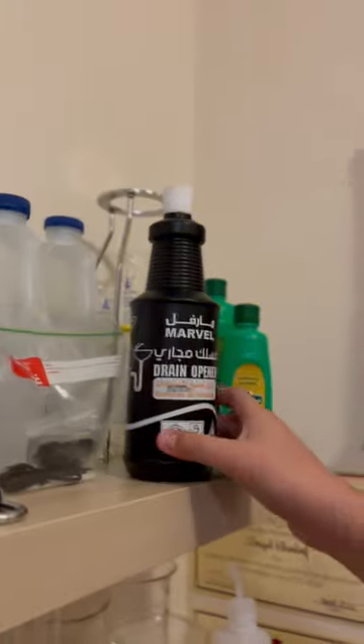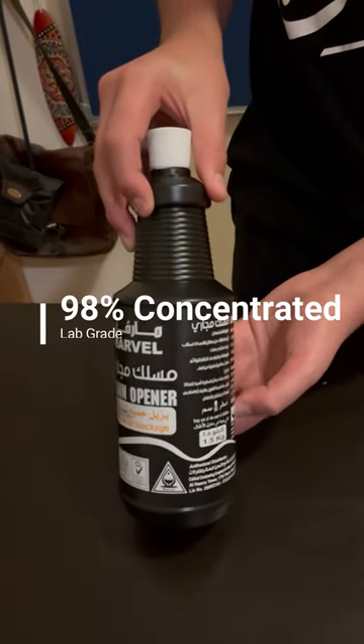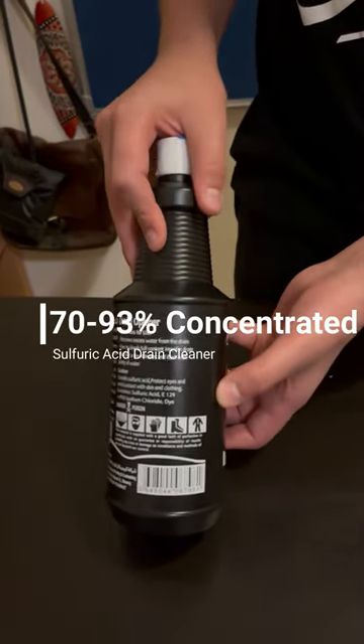Drain cleaner. Is it powerful enough to dissolve an entire roll of toilet paper? It should be noted that concentrated sulfuric acid often means 98%, and the drain cleaner we're working with in this video is only about 70 to 93%.